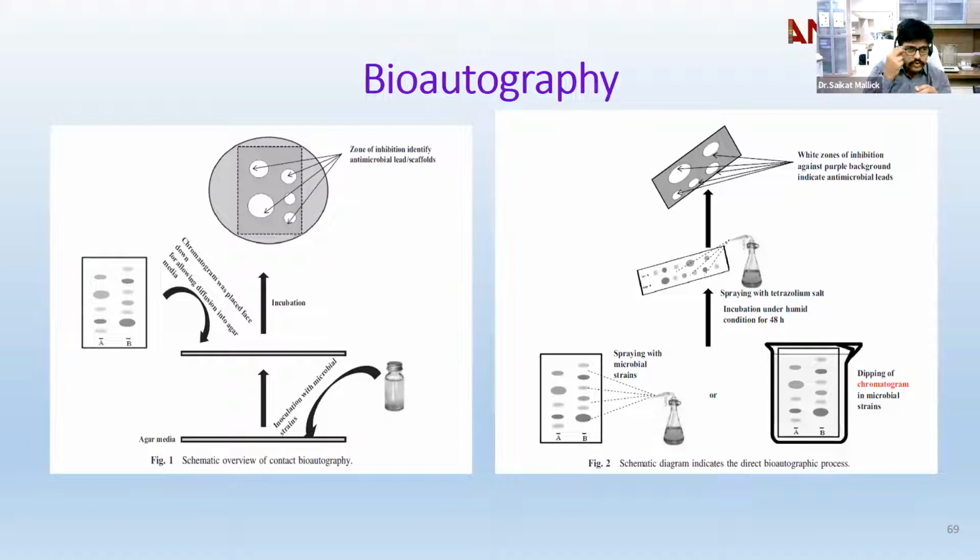So you have to take those bacteria which are available at the respective providers. There are a few national cell culture laboratories which have these bacteria with them. You purchase them, get those bacteria to your place, prepare the agar medium, and autoclave it. Agar medium is initially in liquid form; you autoclave it, and once it is thoroughly mixed and autoclaved, you pour it, and once it solidifies, it becomes a thick bed of gel which has all the media for the bacteria to grow. You inoculate the bacteria on it with the help of a nichrome loop, using the streaking methodology.